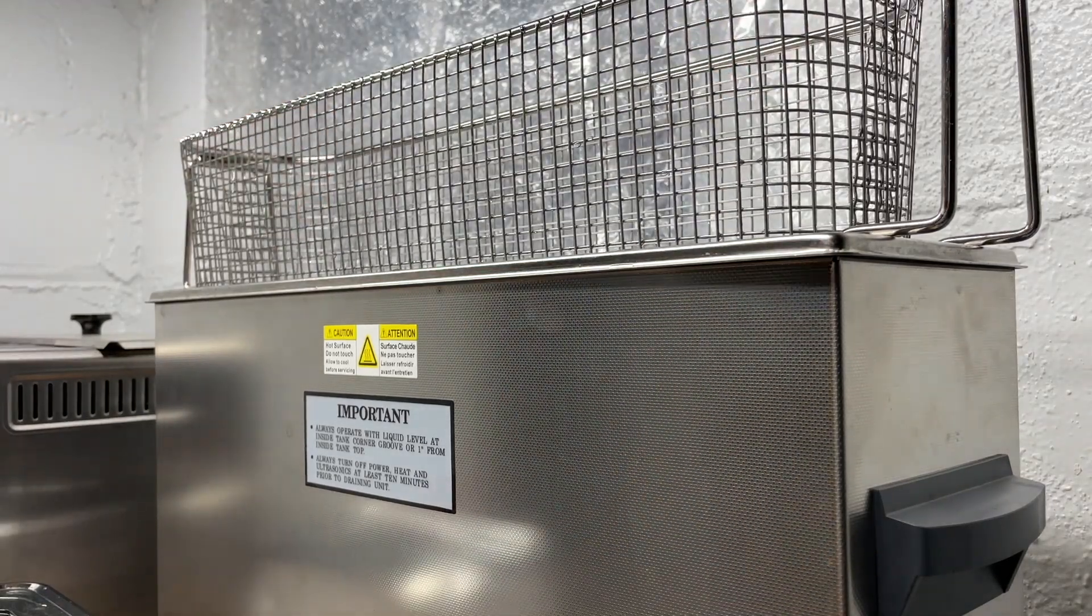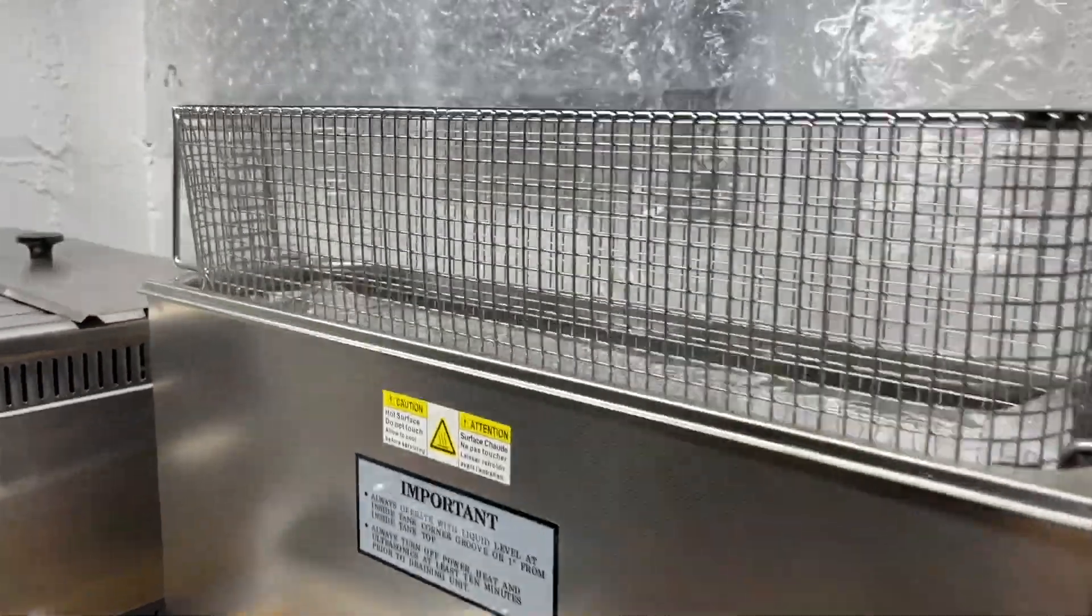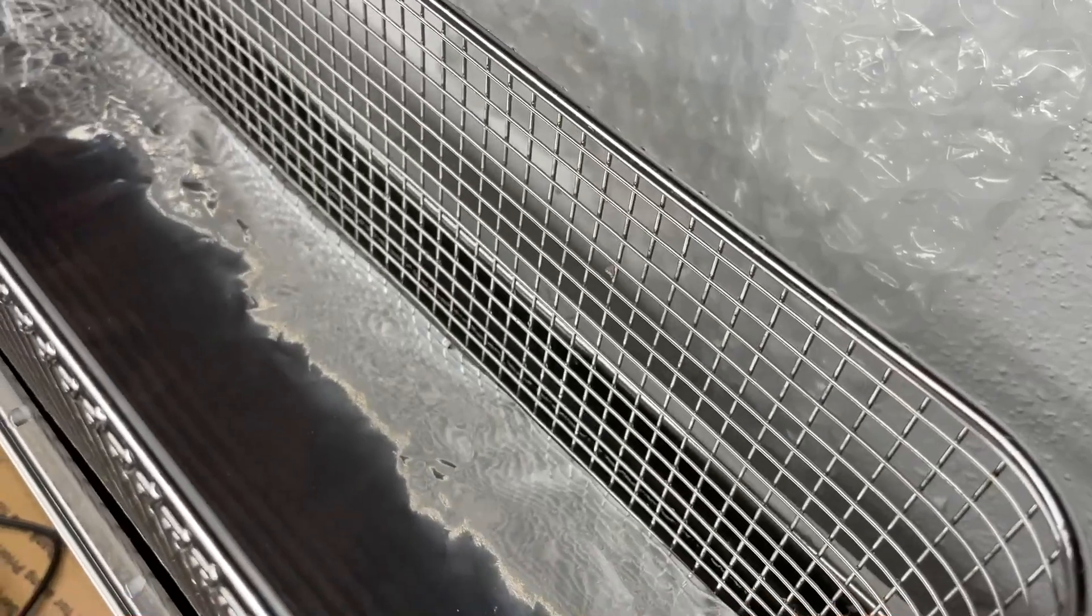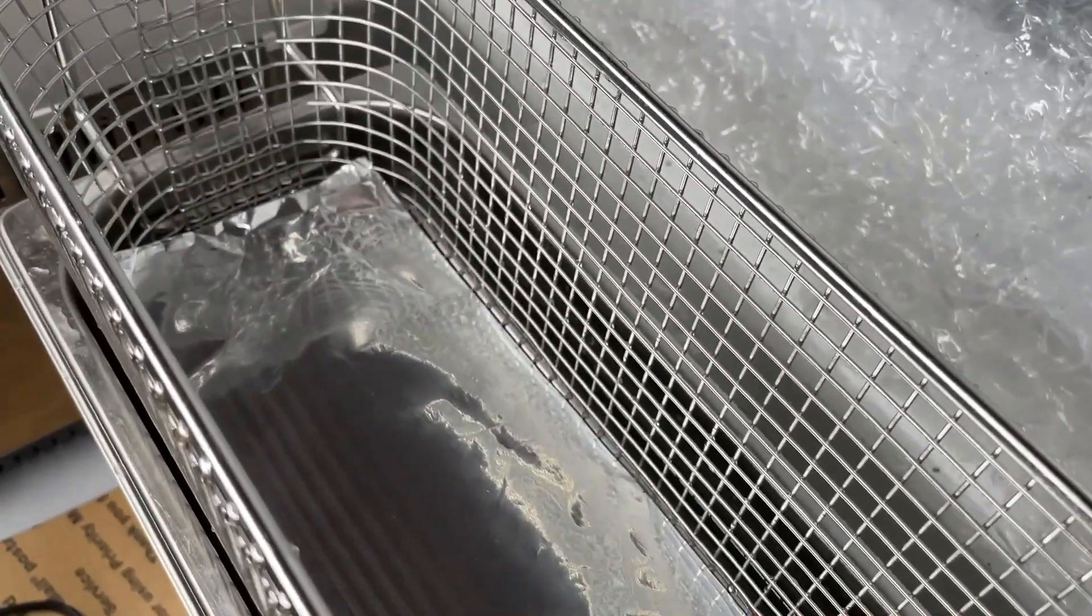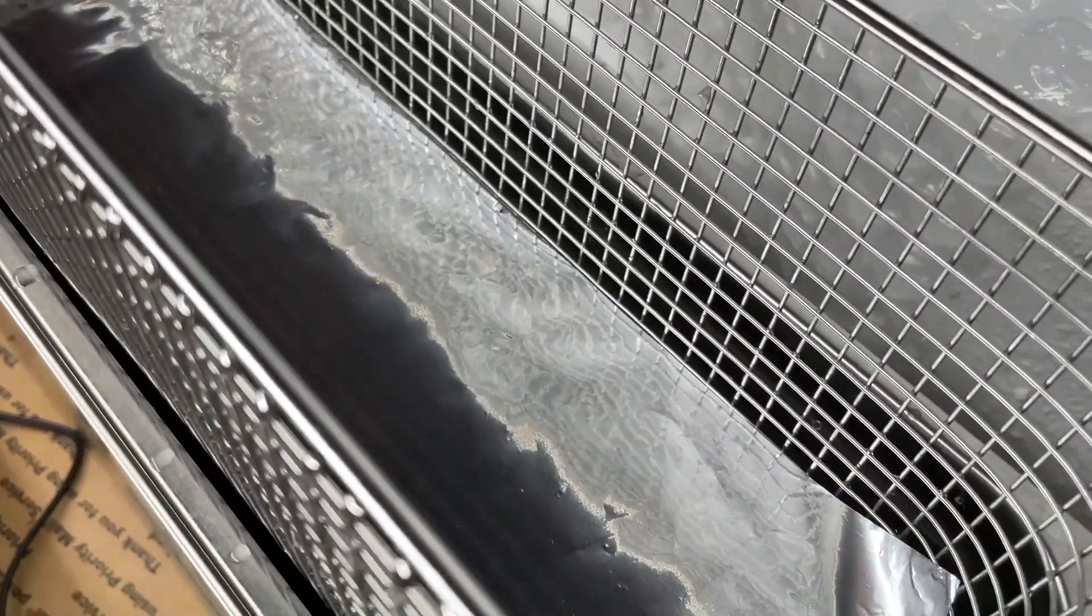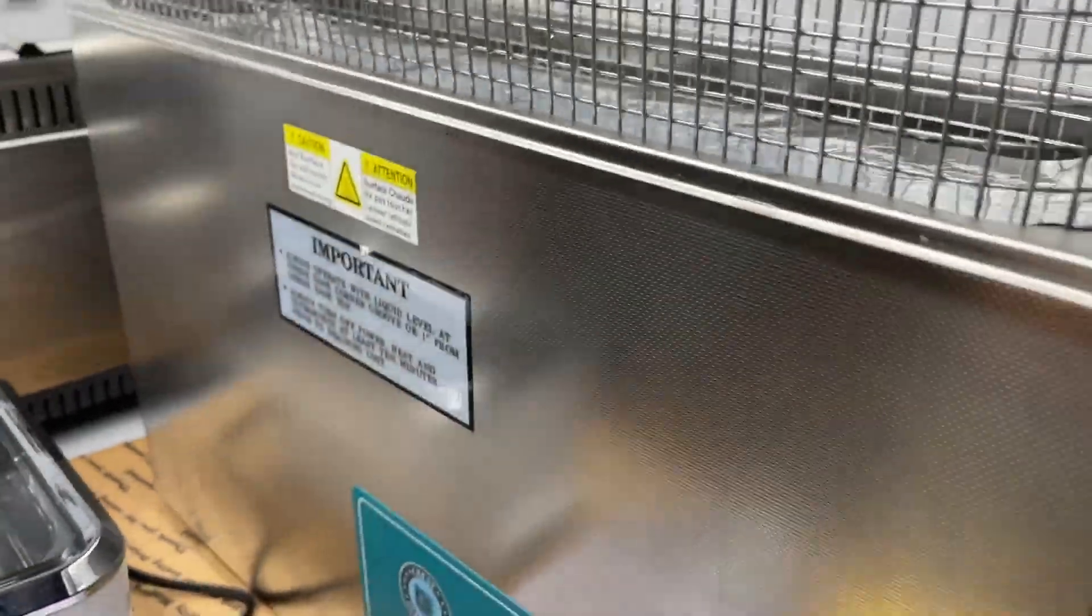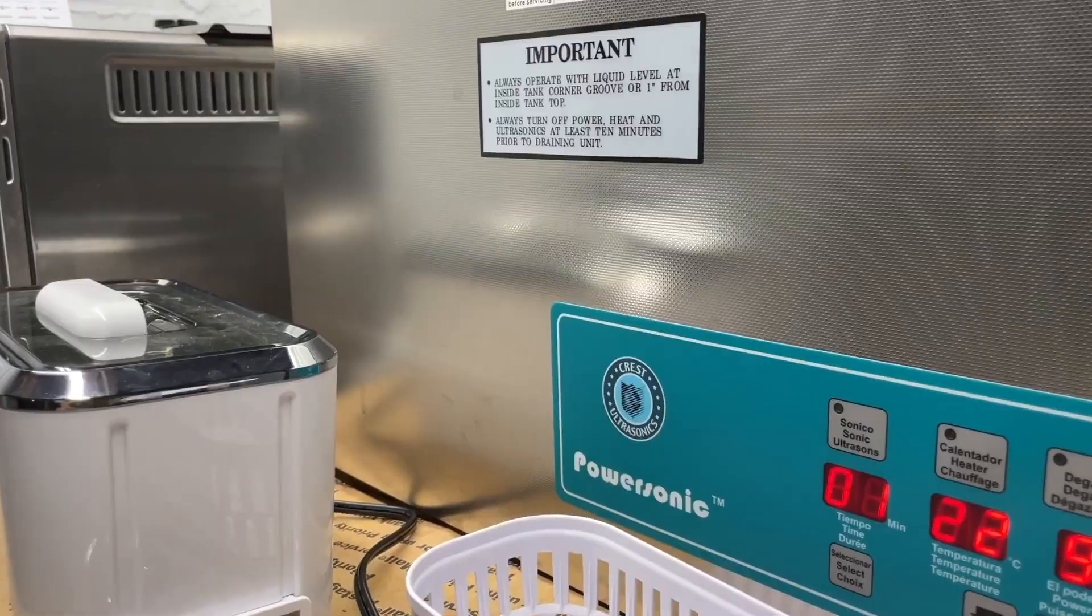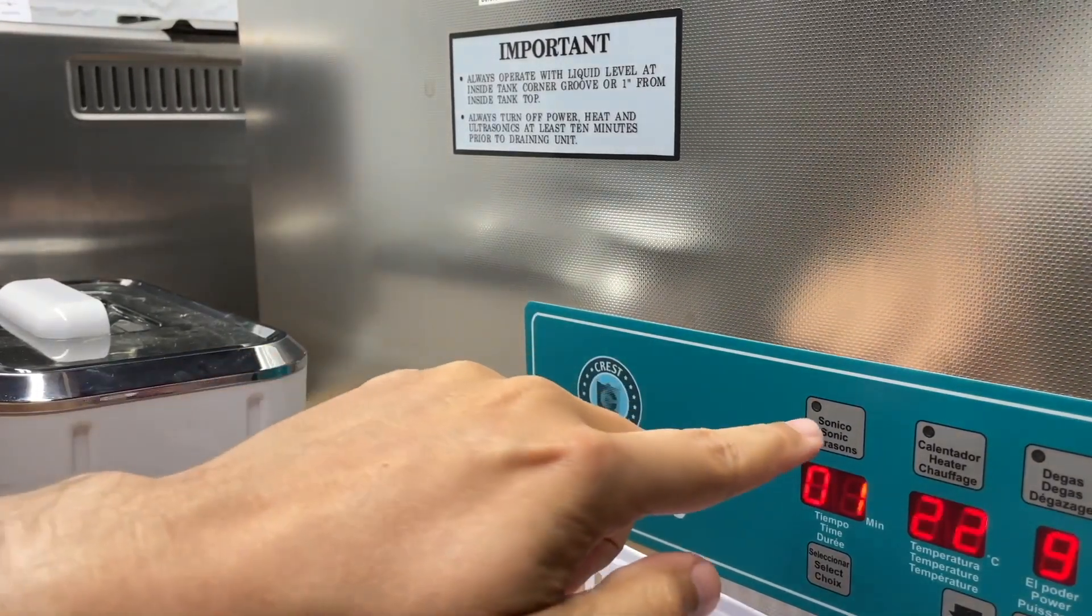All right, quick look inside the cleaner. I don't know if it's easy to tell, but that's the bottom of the basket. I didn't manage to crumple it up too bad. Now I have to lower the basket and submerge the foil so we can run the test and see what happens. Here we go.